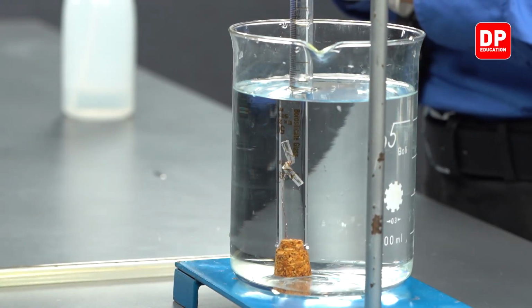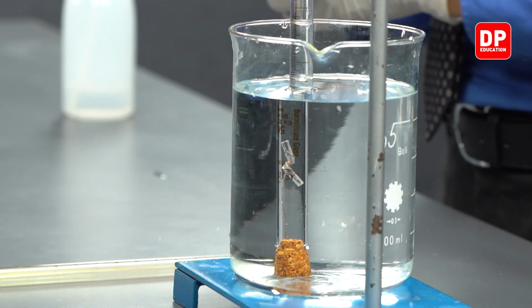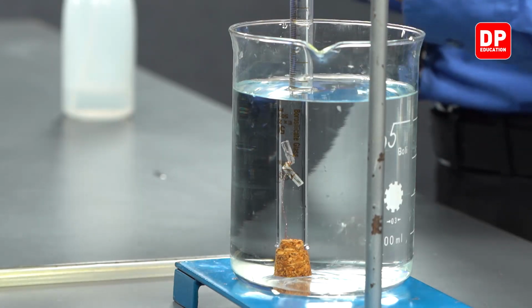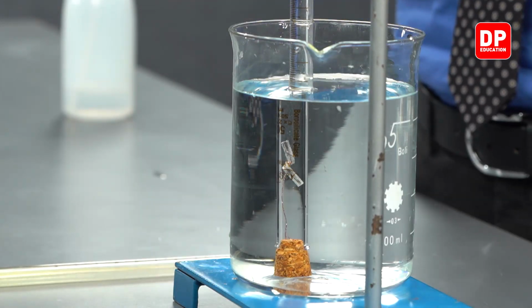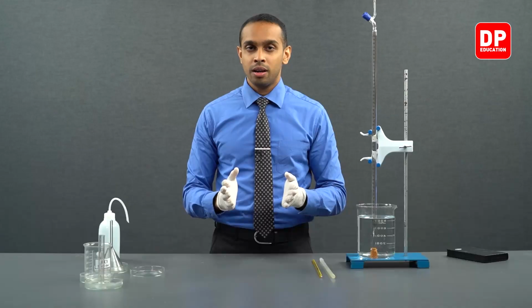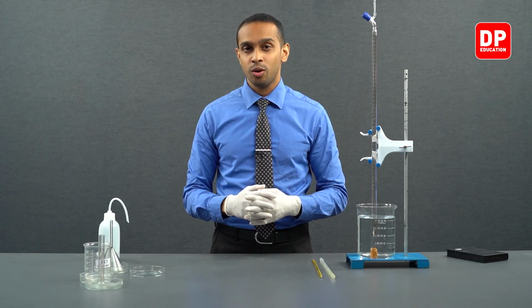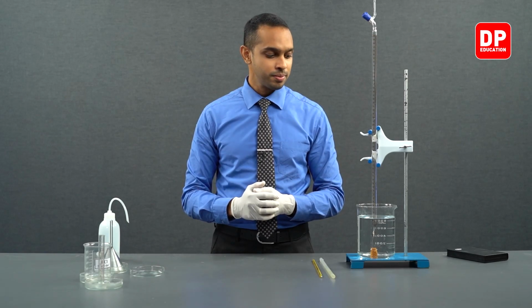After setting this setup, we are going to wait until the reaction starts. Reaction has not yet started because we can see there are no gas bubbles being formed around magnesium, indicating that HCl has not yet come down to react with the magnesium strip. After a while, you can see that the reaction has initiated when you can observe the formation of gas bubbles.